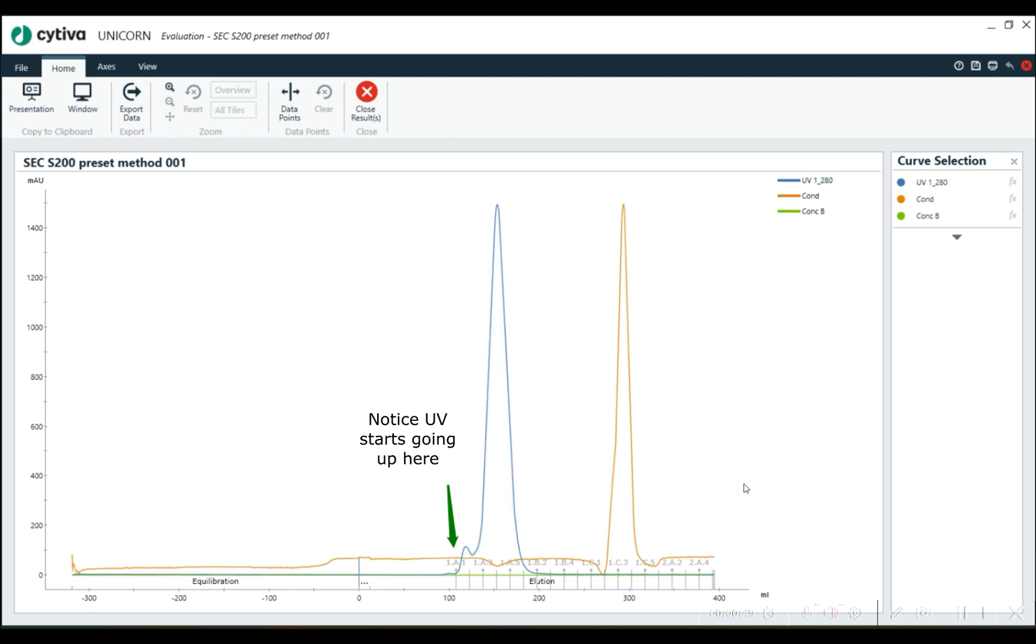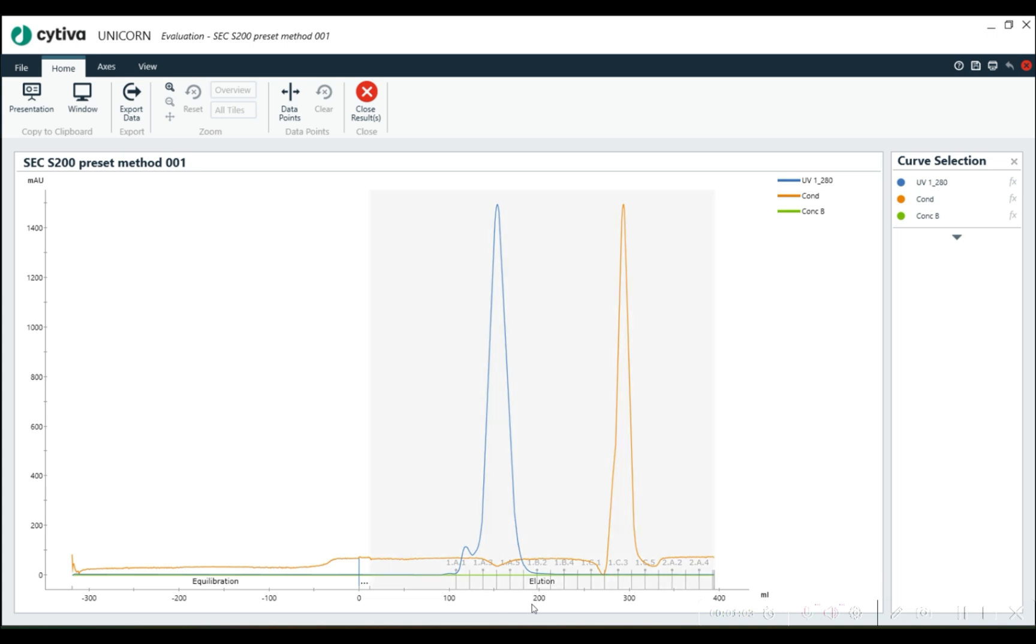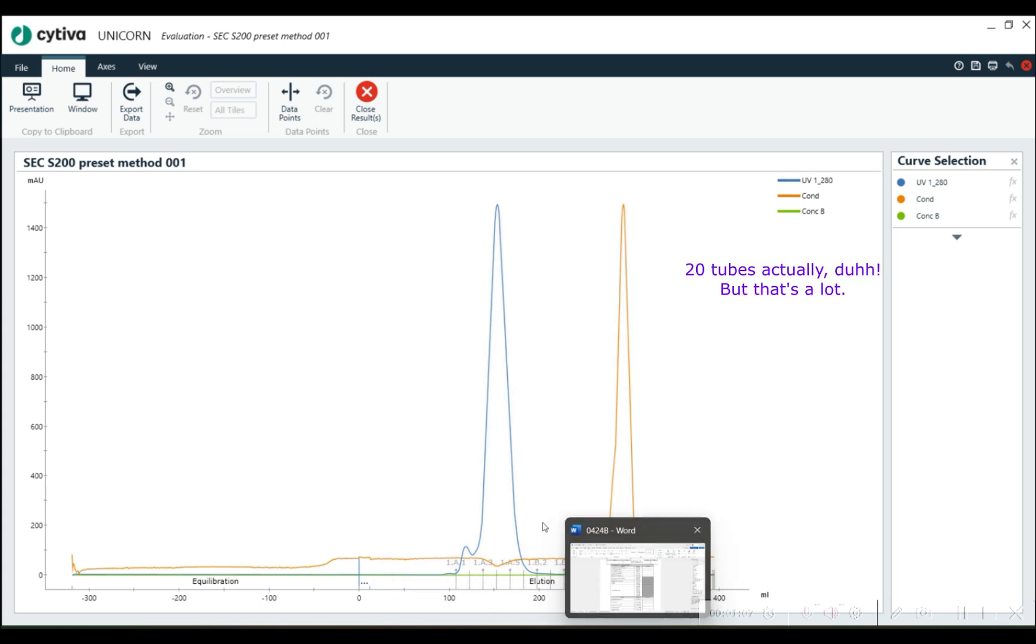And then after that, as soon as we hit fractionation, we go to lunch, and we come back, and we've collected two racks of fractions here. I think there's 15, so we've collected almost 30 fractions, but we only need the first 10. So that's a waste of a lot of tubes.